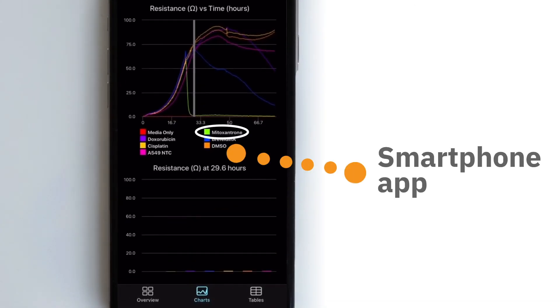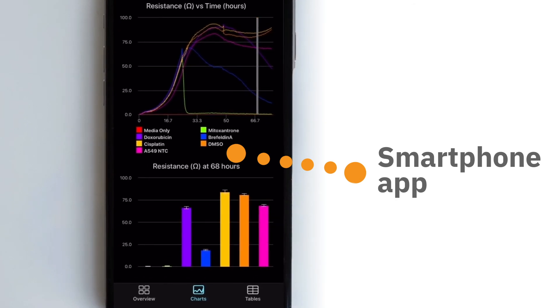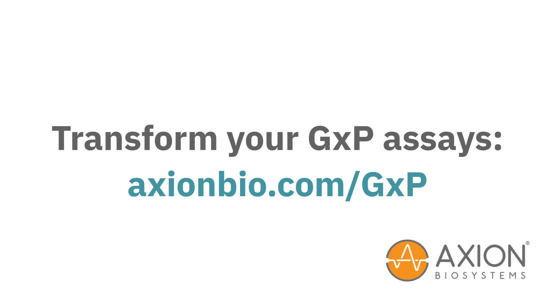And now you can track the progress of your experiments in real-time, even when you can't be in the lab, with the Maestro Z's smartphone app. Maestro Z is designed for your GXP assays. Learn more at axionbio.com/GXP.